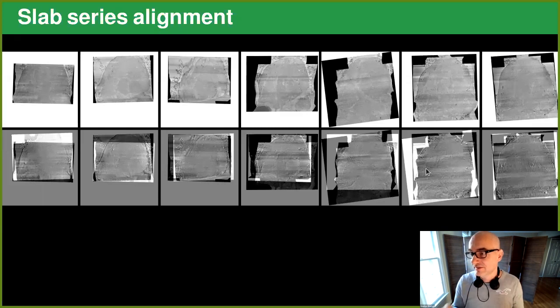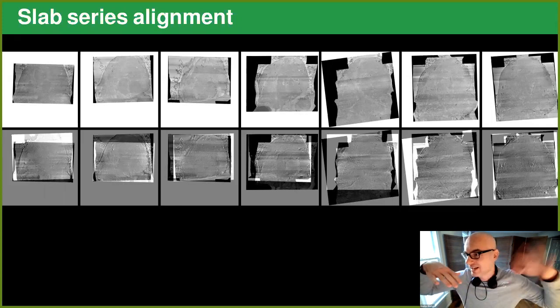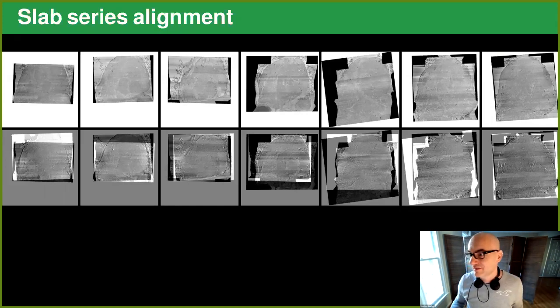That's the first step. And then we start to subdivide this. So you have to keep in mind that each of these fields of view here is 30K by 30K. So these are relatively large 2D images. These are the extractions from these slab faces at the very tip. And they're really dirty because this is the place where the knife cut through the section. And you have some ripple effects. I mean, you try to find a good surface, but sometimes there's knife chatter, so things break off. Sometimes half of a mitochondrion breaks out, so you have white signal where you used to have black signal on the other side and stuff like this. So it's a little bit difficult to find the correct model. And therefore, we do this stepwise.